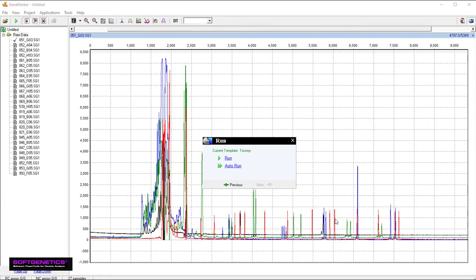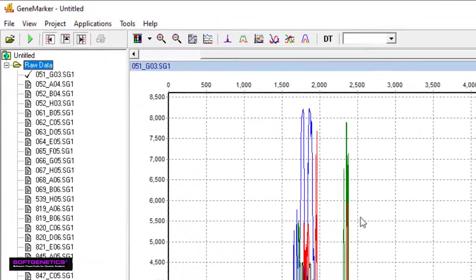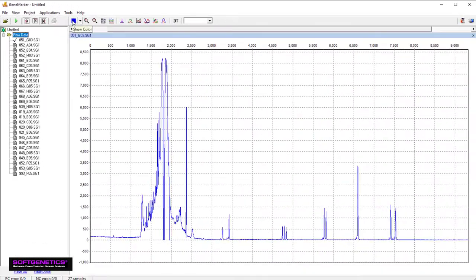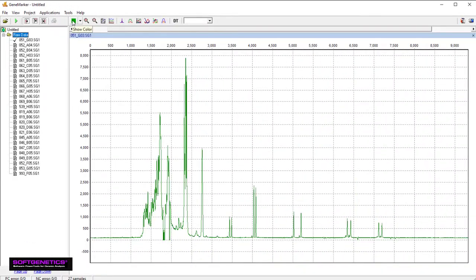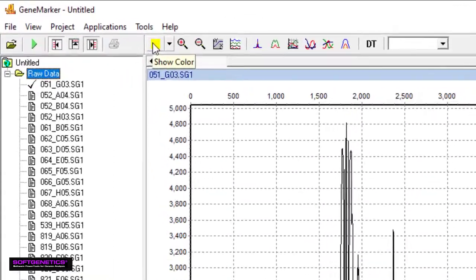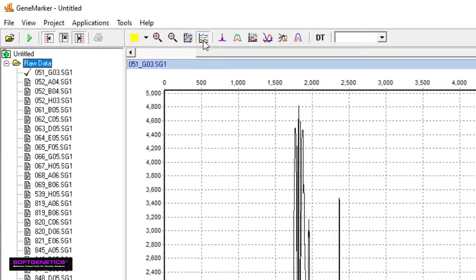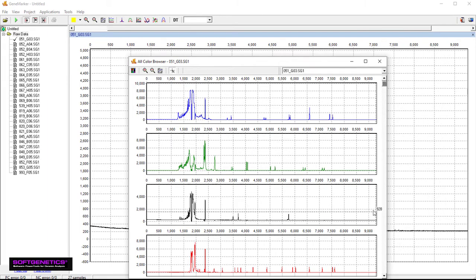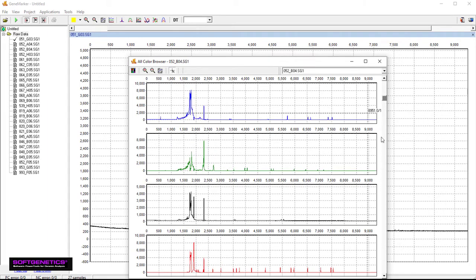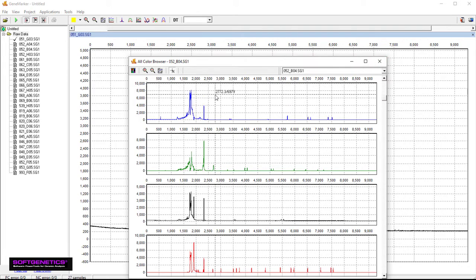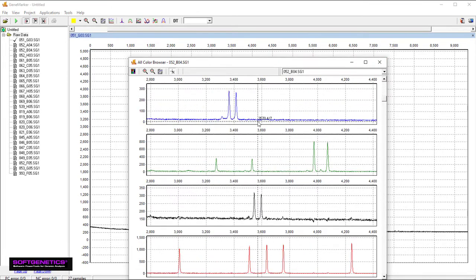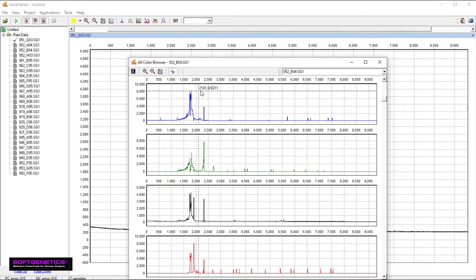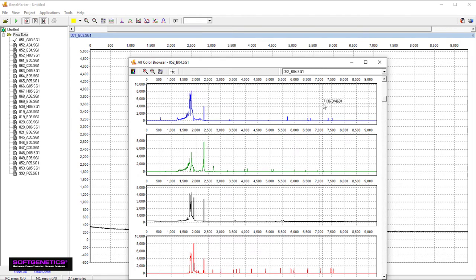Navigating through your data is easy. Scroll through die colors by clicking the die icon in the upper left, or look at all colors simultaneously by clicking the all color browser icon. You can zoom in on a trace by drawing a box from the left to the right. You can zoom out by drawing a box from the right to the left. And finally, scroll by holding the right mouse key and dragging.